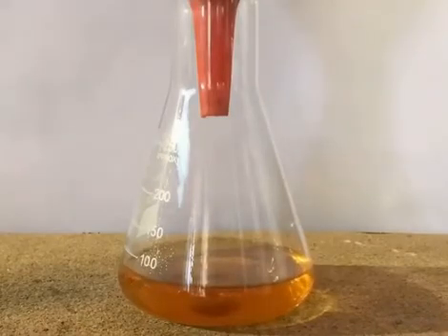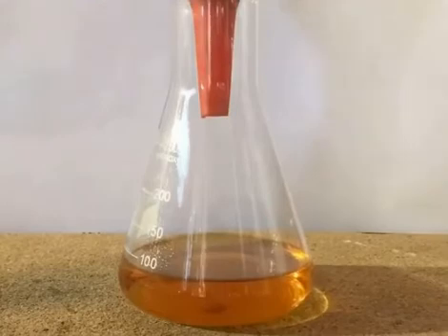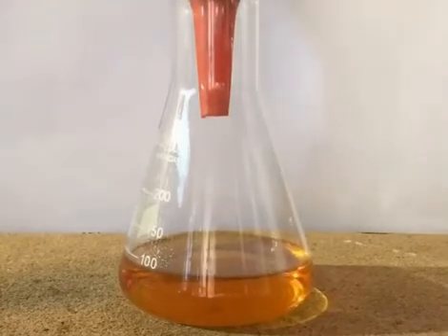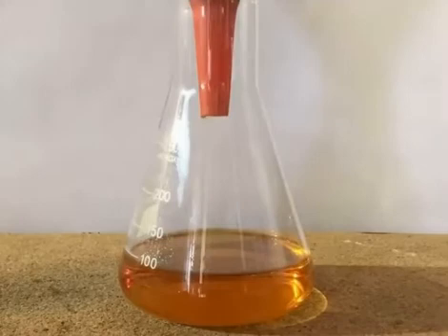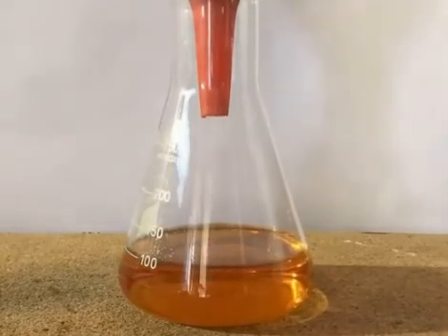The residue in the filter is washed with 80 milliliters of diluted hydrochloric acid. If gravity filtration is used, this step is quite slow, but it can be sped up by replacing the filter paper every once in a while.